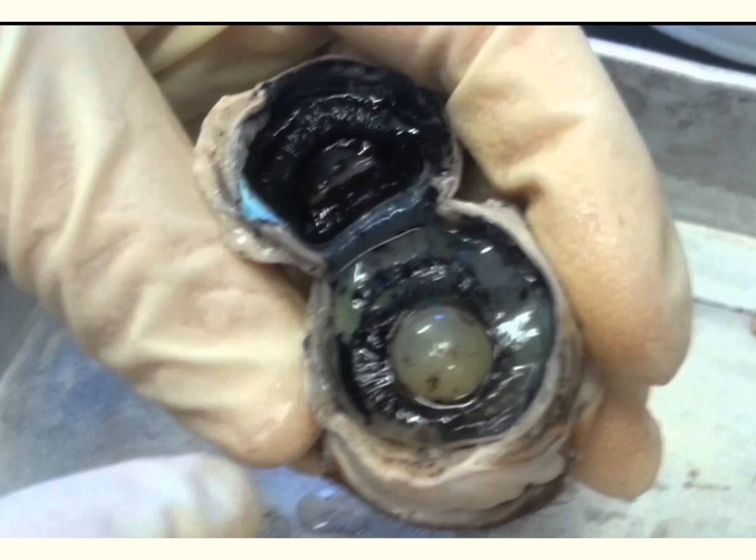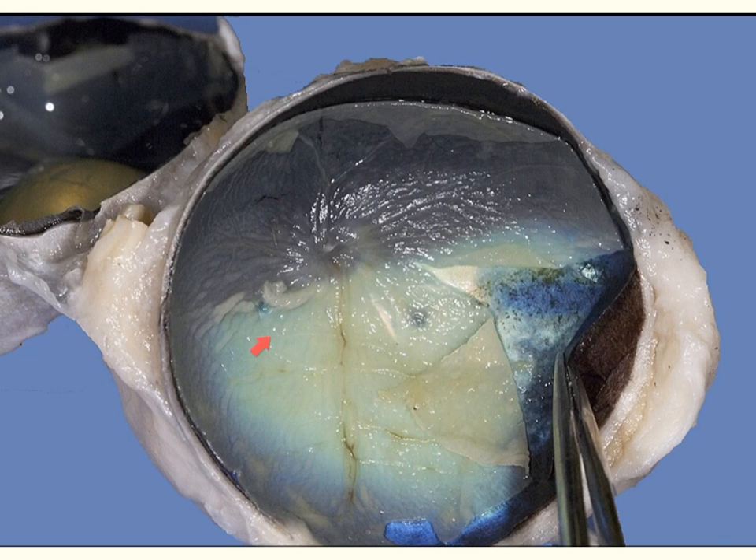Here we have the inside view of the eye showing the lens and vitreous humor. You're going to see a rigid area — this is the front of the eye, and on the other side would be the cornea. That rigid structure is the ciliary body, which connects the iris to the choroid and helps control the shape of the lens for focusing. This tan layer is the retina of the eye, laid out flat.